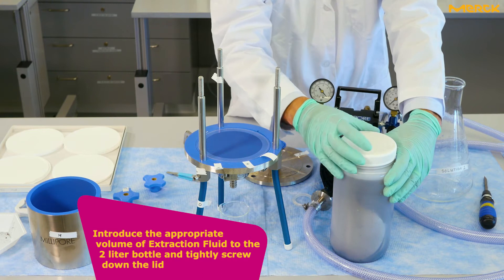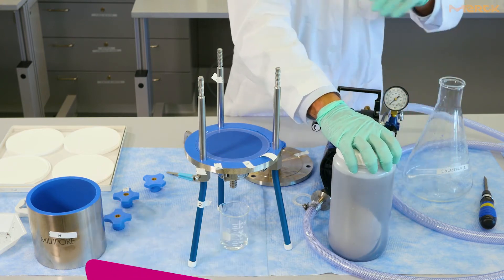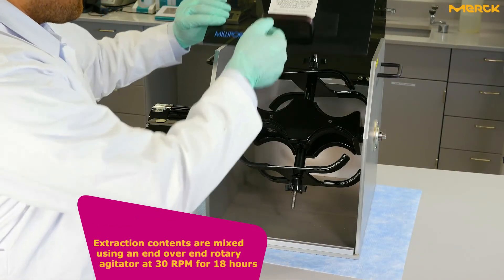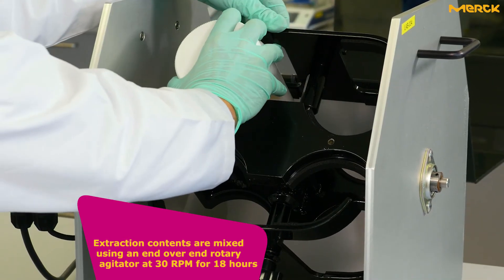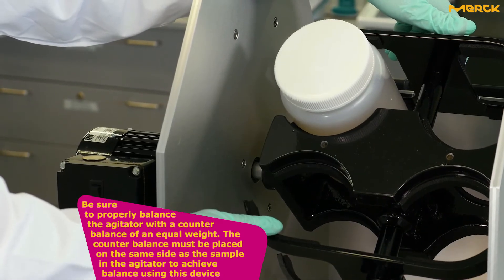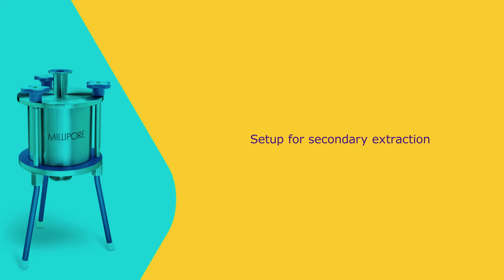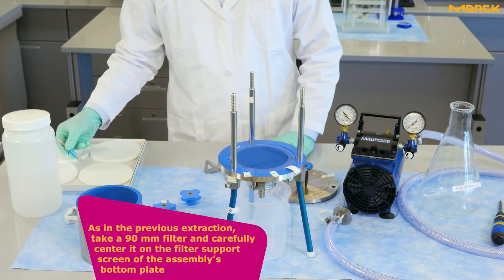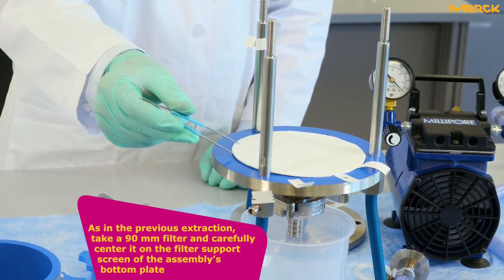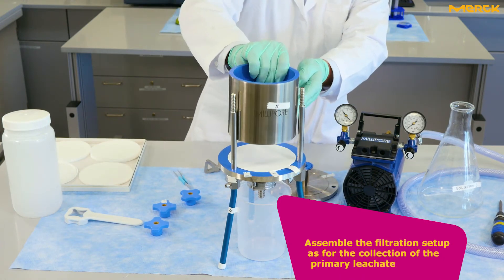Add the volume of extraction fluid to the 2-liter bottle and tightly screw down the lid. Then, take a 90 millimeter filter and carefully center it on the filter support screen of the assembly's bottom plate. Assemble the filtration setup as for the collection of the primary leachate.